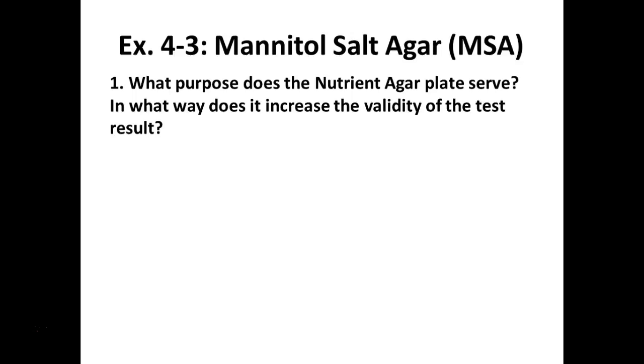Yeah, you do. That's the blood agar. That tells you it's gram-positive. Which side of that plate is hers? So you might have Staph epi as well. You do. Yeah, you have Staph epi.